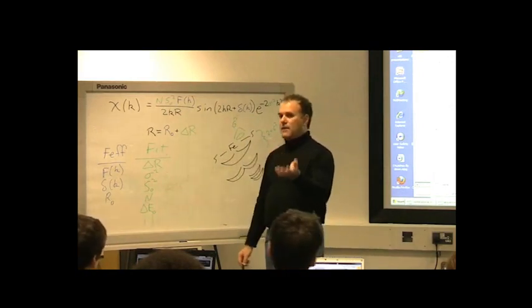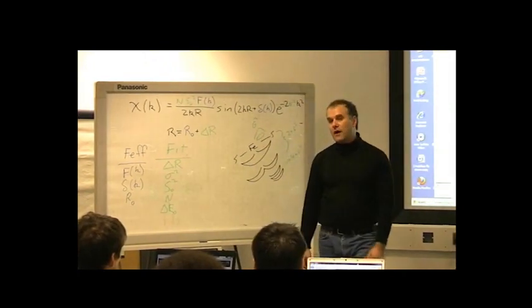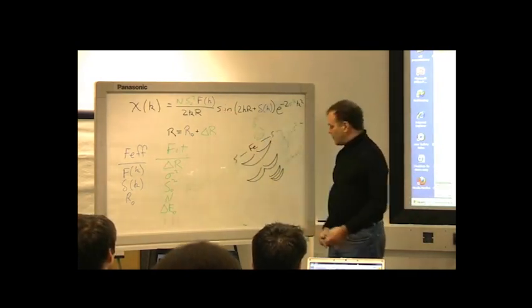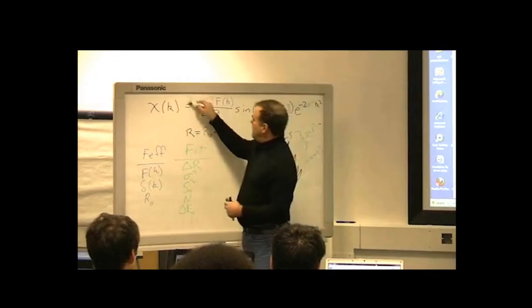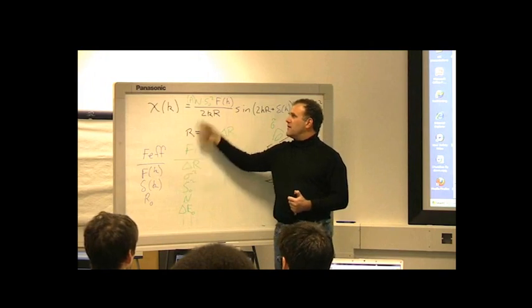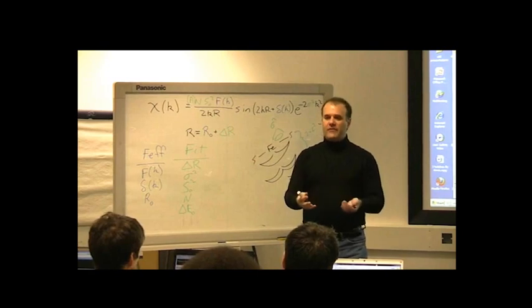But the caveat there is that if you have any inhomogeneities in your sample, if you have any nonlinearities in the detectors at your beamline, or any other weird stuff going on in the measurement, all of the weird stuff that goes on in the measurement tends to affect the amplitude. So there's really a hidden additional term in the EXAFS equation that is problems in the measurement. And if A is not equal to 1, that is, if you had problems in the measurement, then you're going to have trouble using your chemical transferability or whatever. So the short answer to your question is yes. The long answer is yes, but.